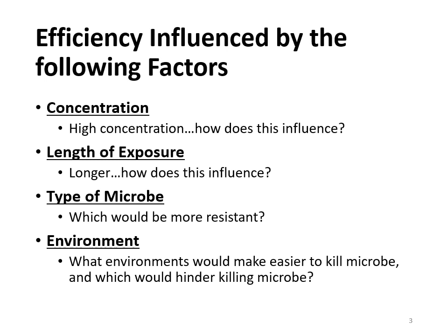But the concentration of the chemical itself, of the antimicrobial, can also have a big influence on how good of a job it does. So for example, using 90% bleach versus 10% bleach. How does that influence the efficiency? Well, higher concentration of the antimicrobial means better efficiency, a better job of killing. There will be more microbes killed.